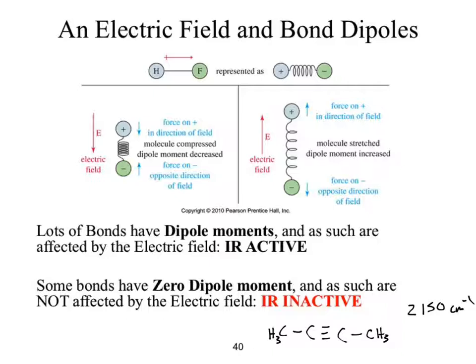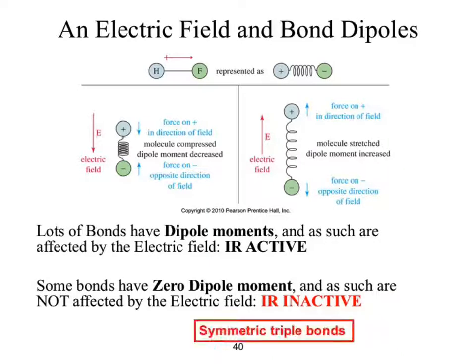So, starting the quiz, just like we've been doing with every other one, we'll run it at 30 seconds. I'm just going to record for 5 seconds if you go home and watch this. So you'll see the spectra pop up for 5 seconds, then the next one will come. There are 4 spectra. I want as much information as you can for each of those 4 spectra within 30 seconds. So 1, 2, 3, 4, dump information about what you see. Okay, starting with number 1.